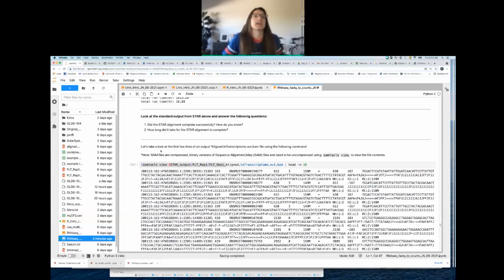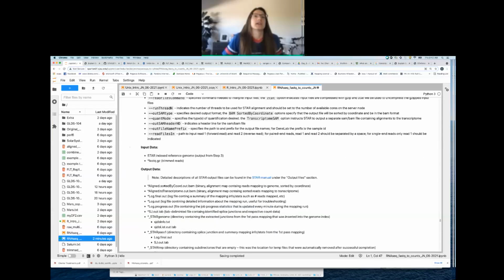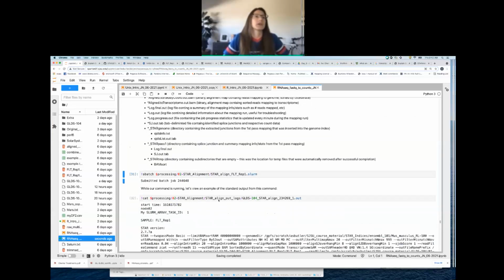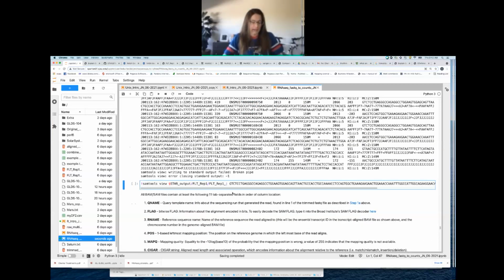And so the end of that is this. And if you guys want to copy this, if you double click on that block that has the word in it, you'll be able to copy the text there. And then when you're done copying it, press play, and you'll get it to look pretty again. And then we're just going to add that suffix to there, and make sure you have your space.